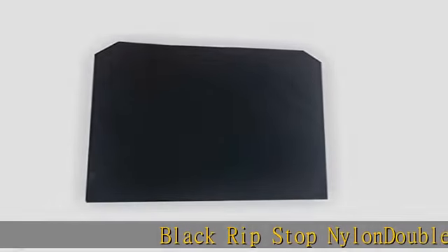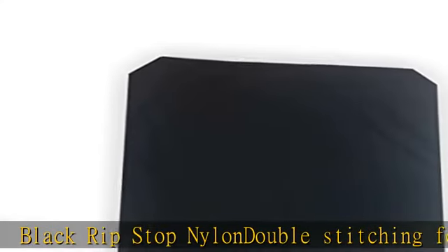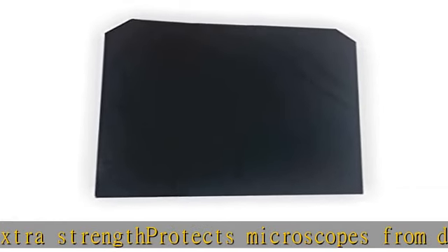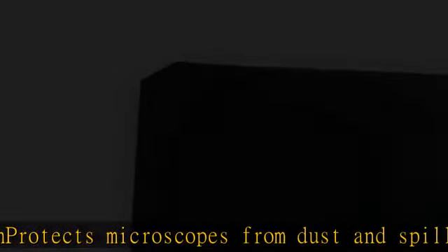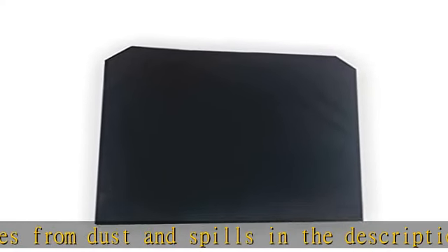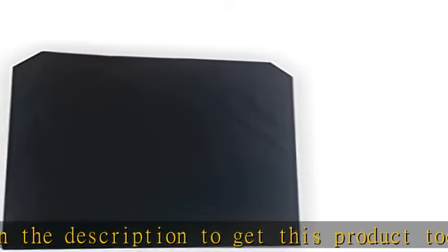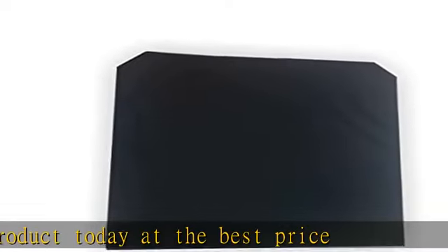Black ripstop nylon, double stitching for extra strength — protects microscopes from dust and spills. Check the description to get this product today at the best price.